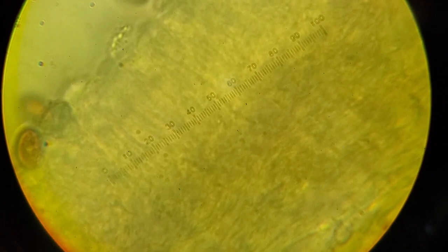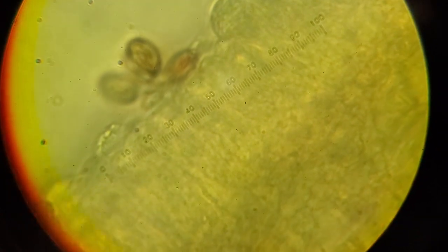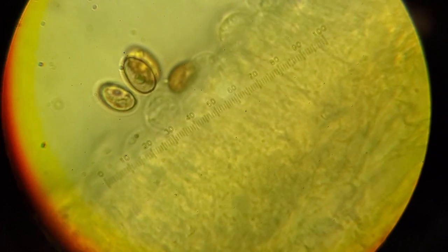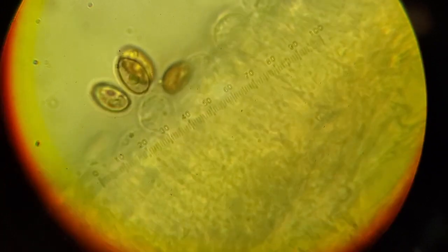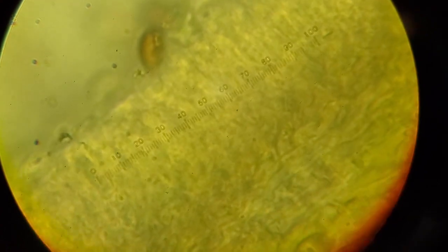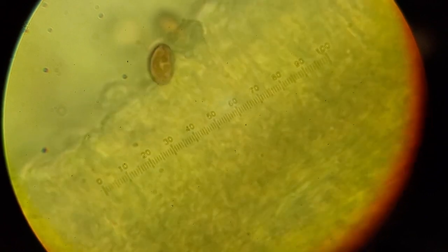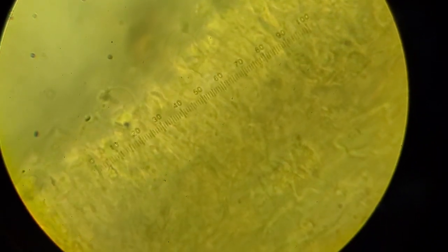So this is our specimen now in oil immersion at highest magnification, and you can see that the structures are much more clear. You can see your basidia, your basidioles. Sometimes, and obviously the spores. You may be able to see sterigmata. And basically these are the sections that allow you to make all the measurements that you'll typically need.